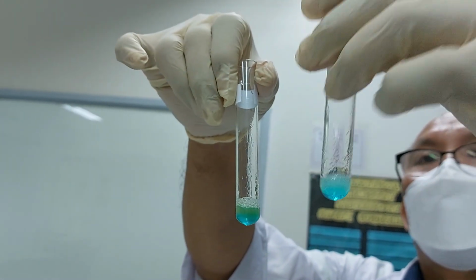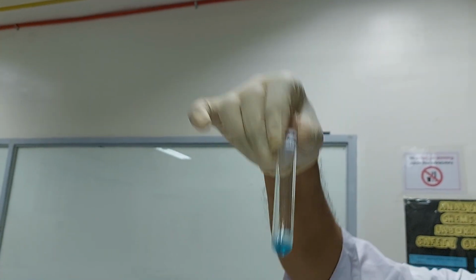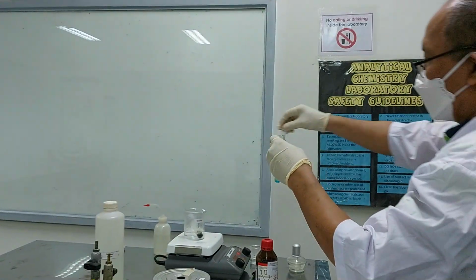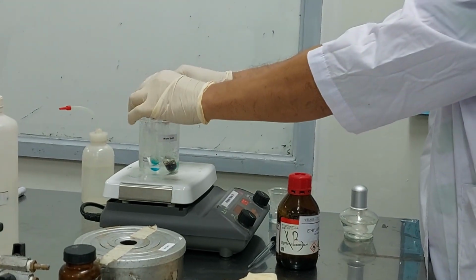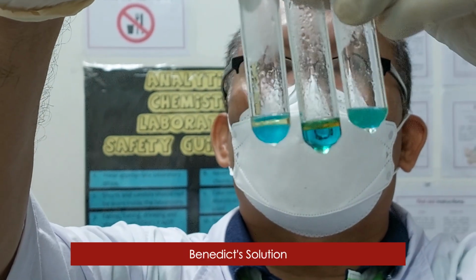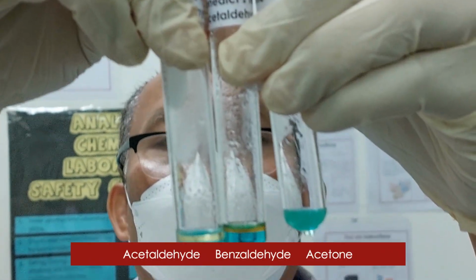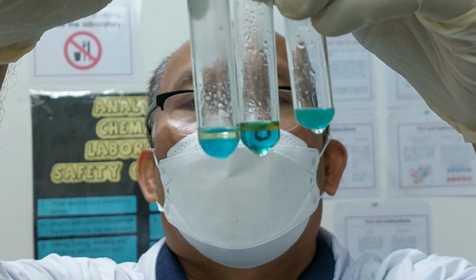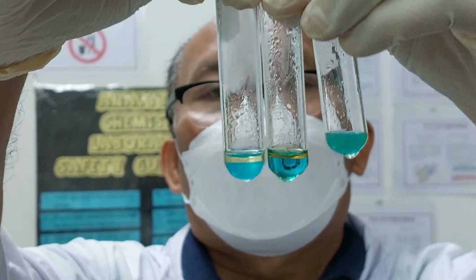For this one also, benzaldehyde. Now we don't expect it for acetone. Let's see if we can produce more of that if we heat this one. You notice the acetone has no change in color, but benzaldehyde and acetaldehyde have that change in color, indicating the positive tests for aldehydes, but not for ketone.